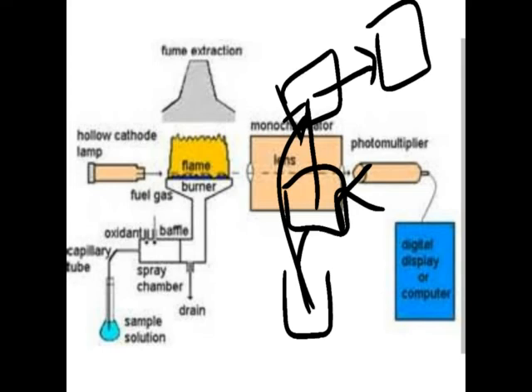Okay, if you remember the structure of block diagram, or you can remember the instrument we used during the practical. So what happens? Through a small inlet, the sample comes inside the instrument. It is aspirated in the atomizer. Then we have the fuel, we have the oxidant.